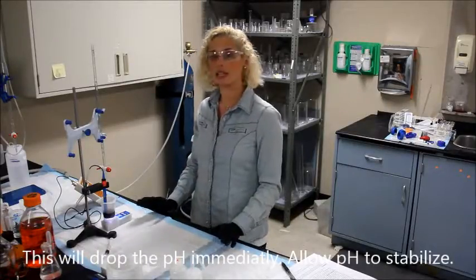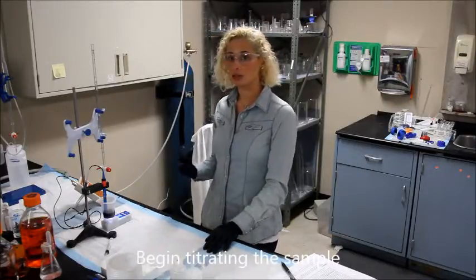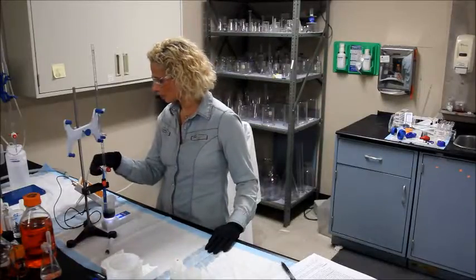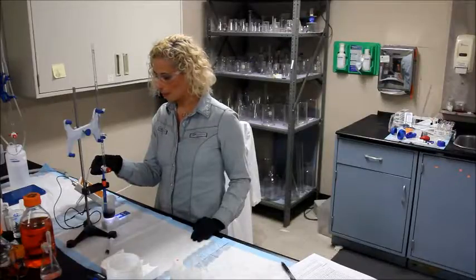Once the pH stabilizes, you can begin titrating again. Make sure to note your initial volume, and begin titrating again slowly, one drop at a time.